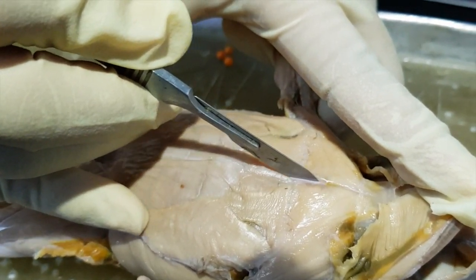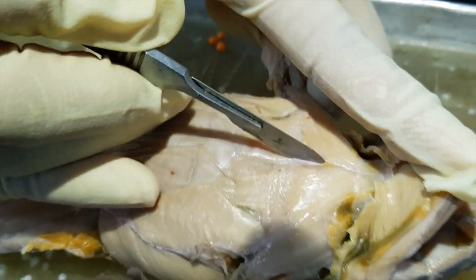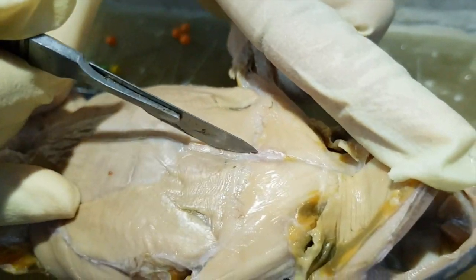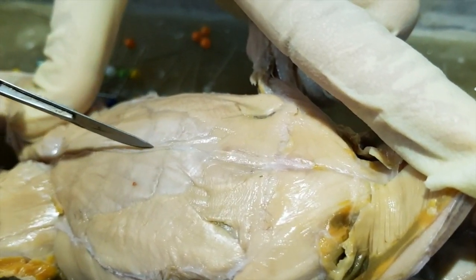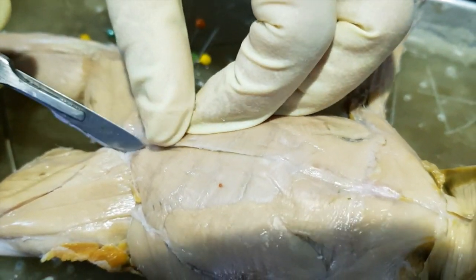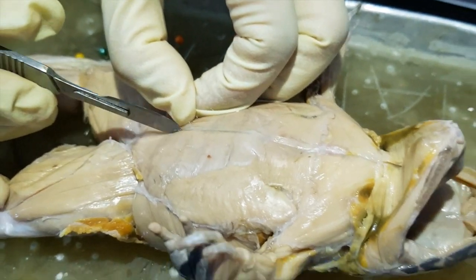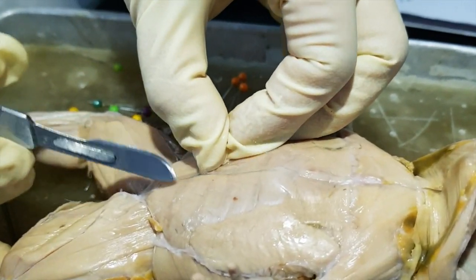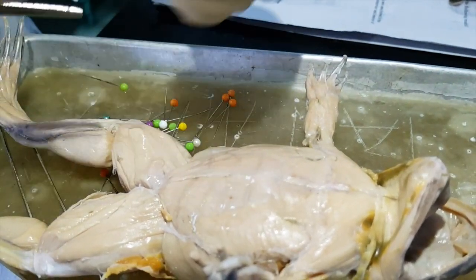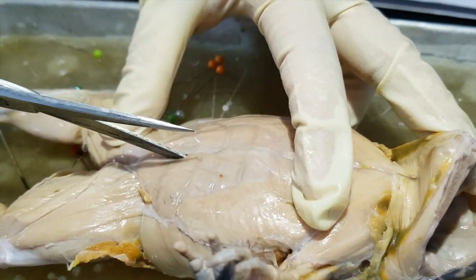At this area here, it's kind of difficult because of the presence of the sternum. Then down towards the posterior region. You may use the scissor with the blunt end inside.